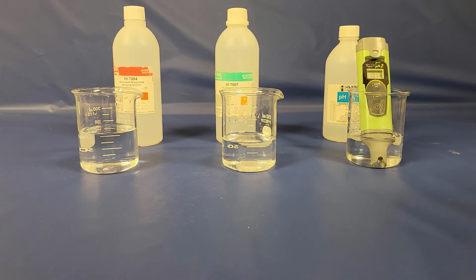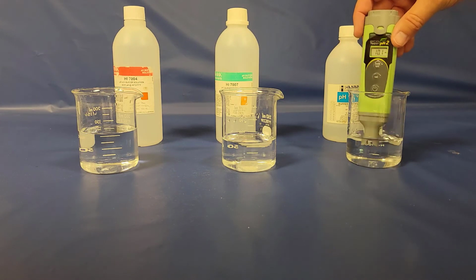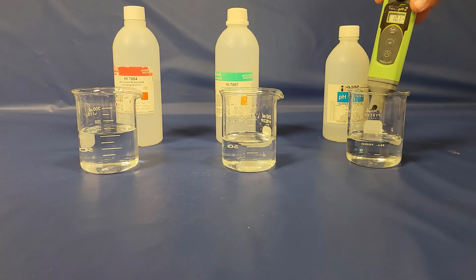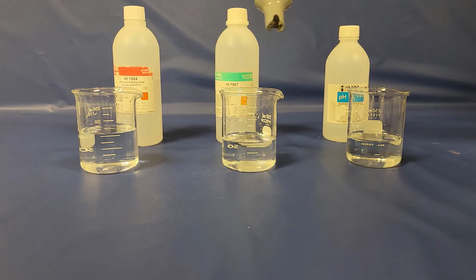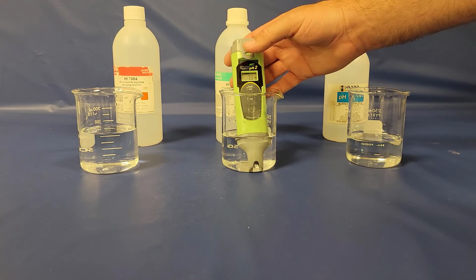Okay, or pretty close. I mean, again, these are field instruments. They're not going to be perfect. All right, so that means we've now finished our calibration. And so what we'll do here is we'll just go through and see if it kind of nails each of the solutions now. So let's go back to 7. See what we get there.